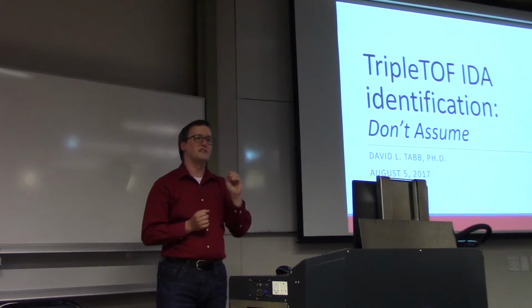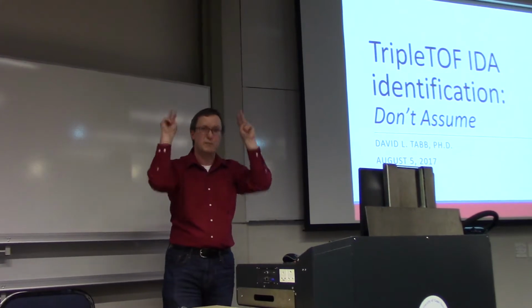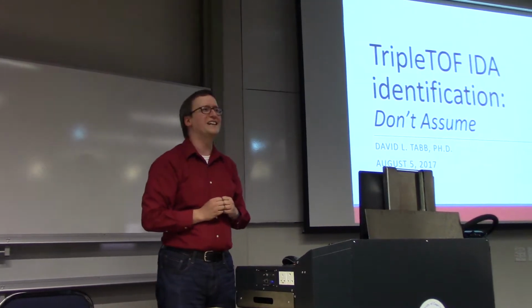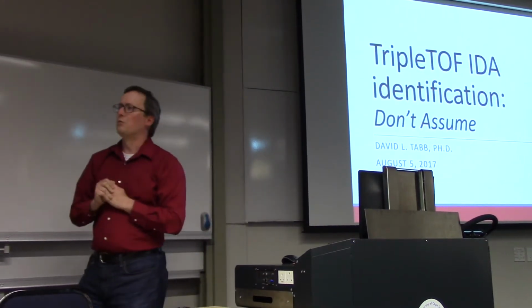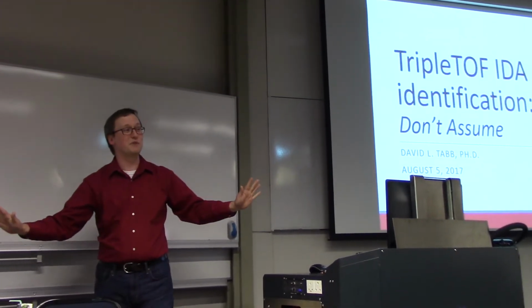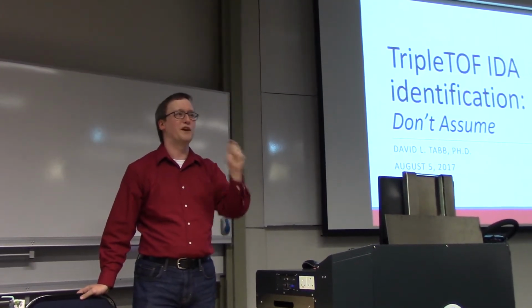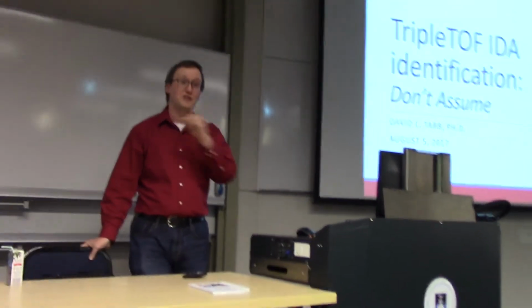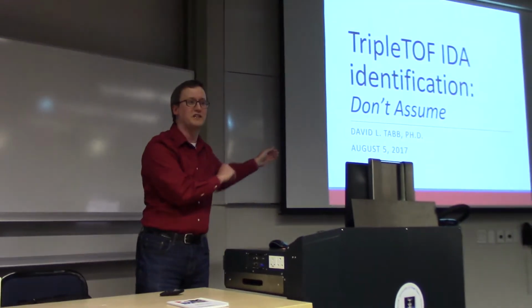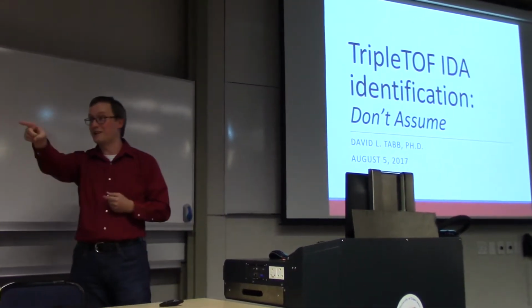So that is an approach that is designed to make data-independent volumes, like those from SWATH, look more like data-dependent volumes. But I will note that data-dependent doesn't appear anywhere in my title. Instead, I've got IDA, and I'm gonna wake up Grant on this one. Why am I saying IDA rather than DDA? I'm thinking, I hope my information is still current, that data-dependent acquisition is actually a term that we carry over from the fine world of Thermo Fisher. And they didn't use the same name for doing data-dependent acquisition in TripleTOFs and in the preceding Q-trap instruments, because they use a method they call information-dependent acquisition. Am I correct on the naming of that?